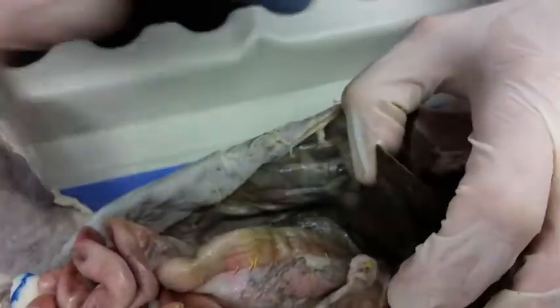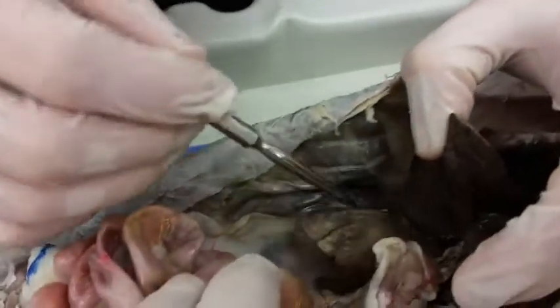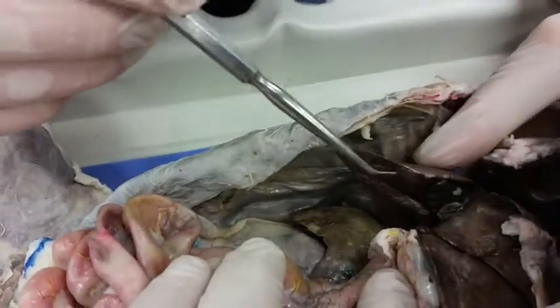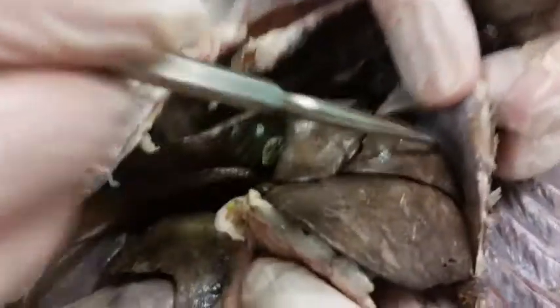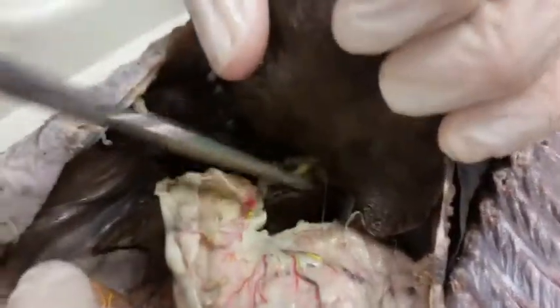Okay, so the way this works, right hand side, we've got the caudate lobe, which is actually two lobes. So we have the caudate, and then we have the lateral, right medial. We have the quadrate lobe, then we have left medial, and then left lateral.